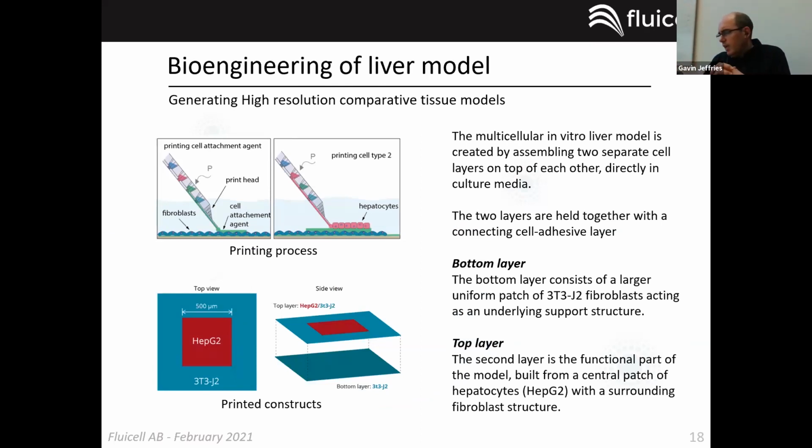Here in this particular example, we're using 2 cell types. We're using hepatocytes and fibroblasts to build up a 3-dimensional structure. So here we used a fibroblast, again, as a base layer, something to have at the bottom of this cellular stack. And then we patterned the HepG2s on top of this base layer. Now, to confine the HepG2s and give them more of a native environment, these were then enrobed with additional fibroblasts to confine them and really help establish a more three-dimensional, or more native microenvironment.